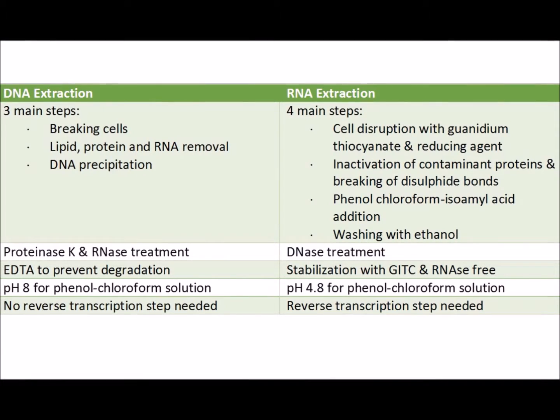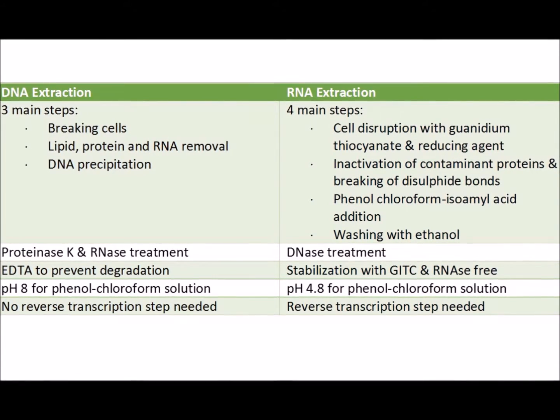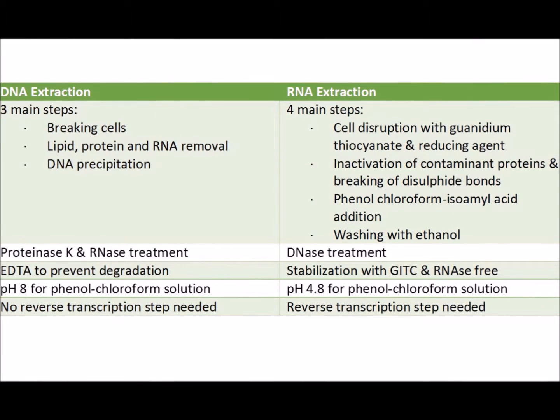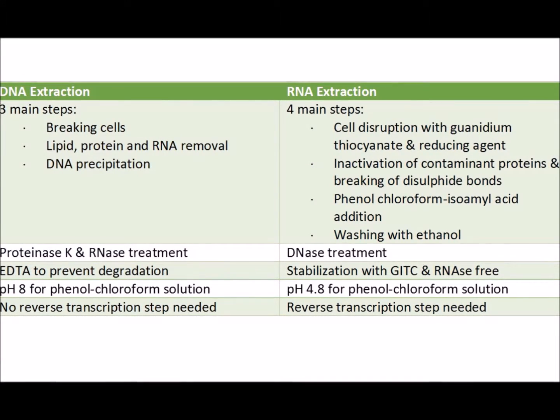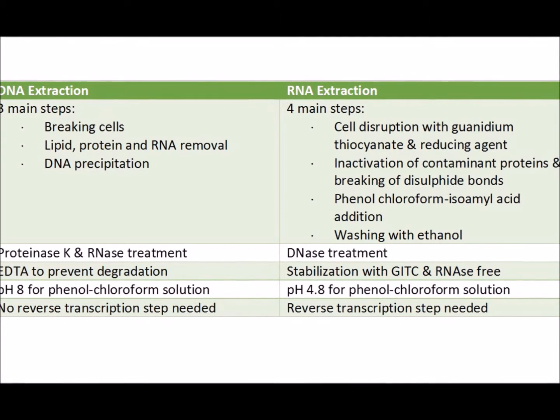For the purification of the sample, different enzymes need to be added. For example, for DNA, proteinase K and RNase treatments need to be made. For RNA extraction in general, DNase treatment needs to be made.